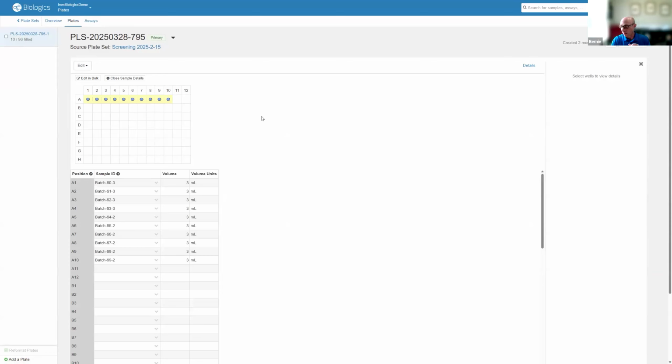So I really only showed you 1.5 of the supported activities around plates in the system, but again, this is just supposed to be a quick demo that we can then circle back on in a private conversation to talk more about your particular use cases. Okay.